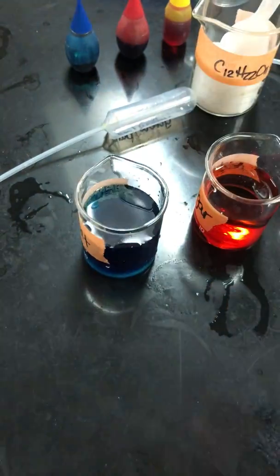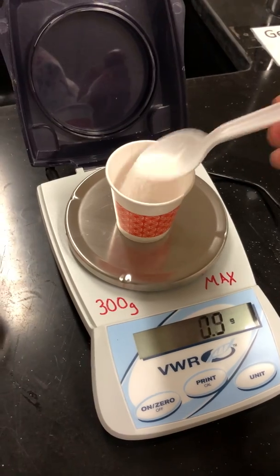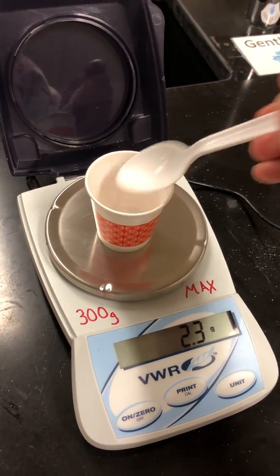All right, it says to put the salt into the blue. And then my partner would start stirring that. I'm obviously not going to. But you know, the cool thing is water, it's amazing. You'll learn more about that in Chem B. It's going to start dissolving that without stirring. And it will do that faster with salt than with sugar, but we'll talk about that later.